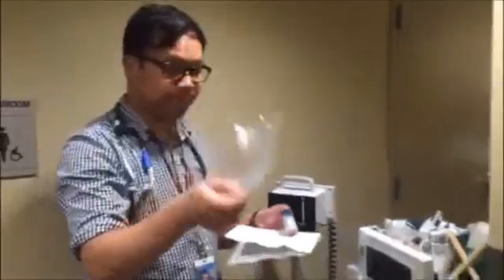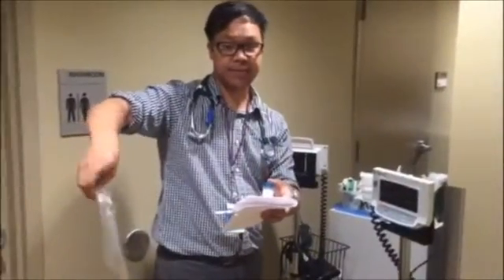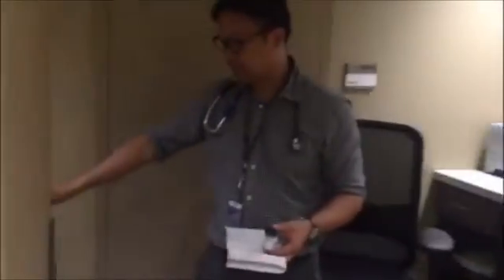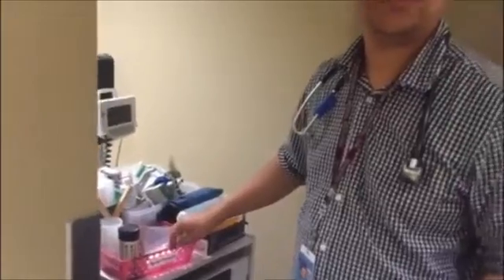So you grab a baggie, you put your labeled specimen in the bag, and there's a little pocket here at the side of the bag that you put the requisition in. Once that's done, you put it in the specimen container, just labeled specimens. Also, alternatively, there is a specimen container by the clinic aid desk.